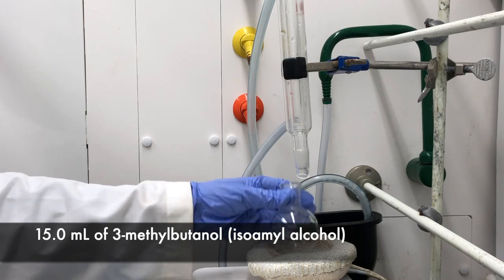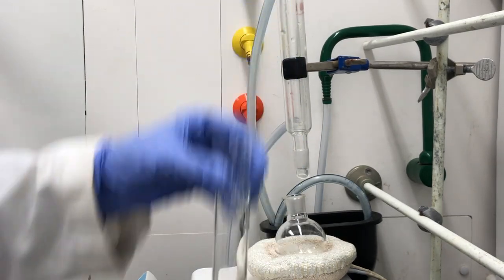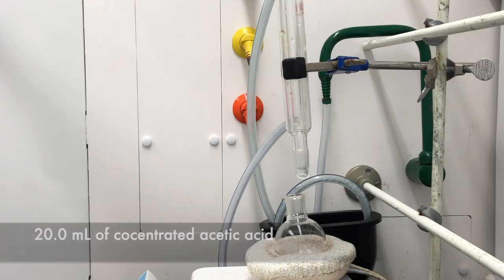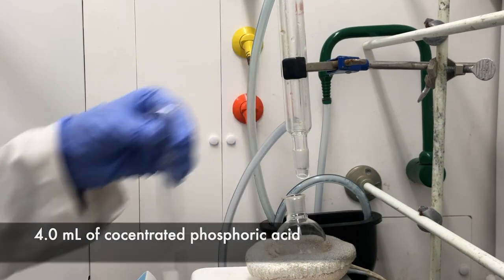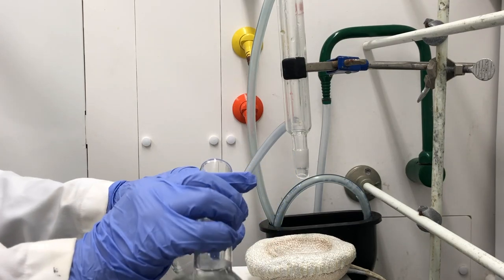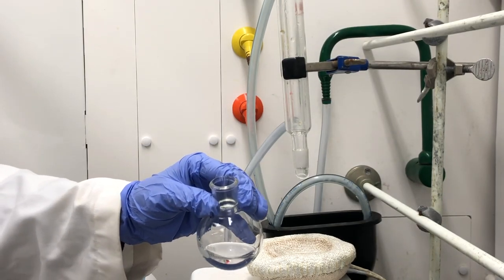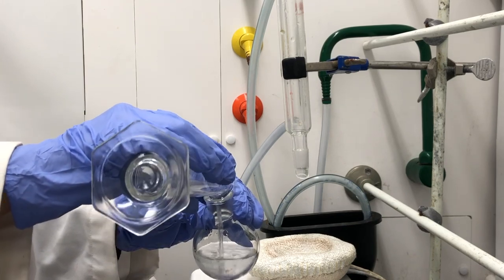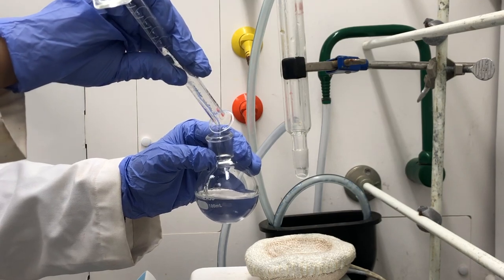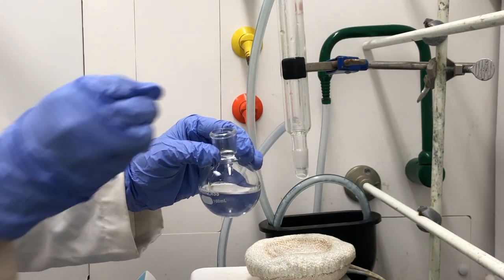Now we're ready to add the solutions to our round bottom flask. I've measured out 15 mL of isoamyl alcohol, 20 mL of concentrated acetic acid, and 4 mL of concentrated phosphoric acid. We'll add the isoamyl alcohol and acetic acid into the solution, and then add the 4 mL of concentrated phosphoric acid, which is acting as a catalyst. We'll also need to add our stir bar.